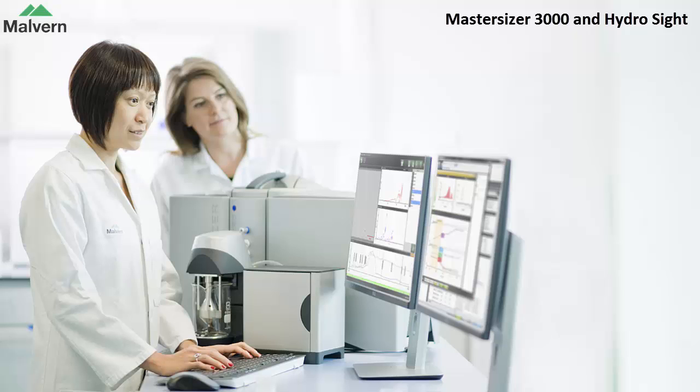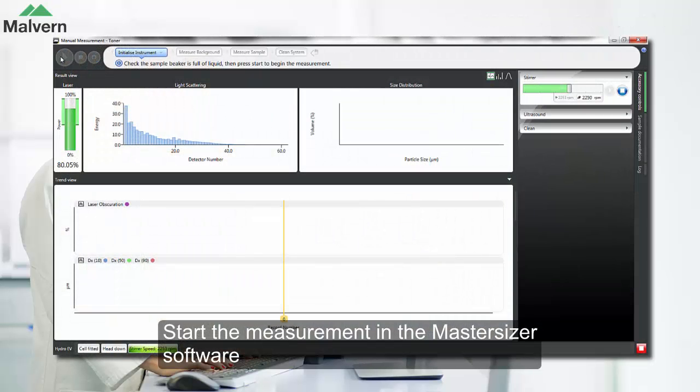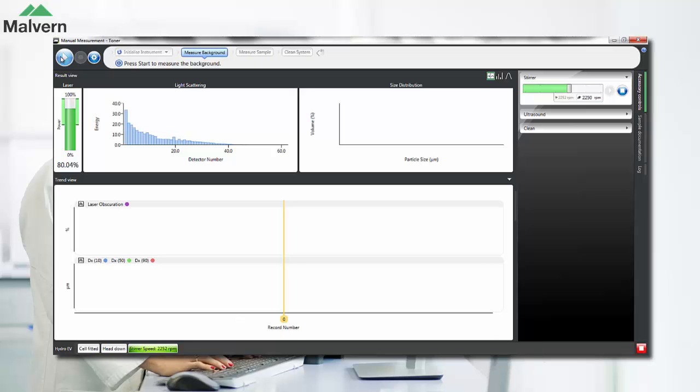This video introduces the new HydroSight accessory for the MasterSizer 3000 and looks at how it can be used as an aid to method development for laser diffraction. The HydroSight is an imaging accessory placed in line between the dispersion unit and the measurement cell.